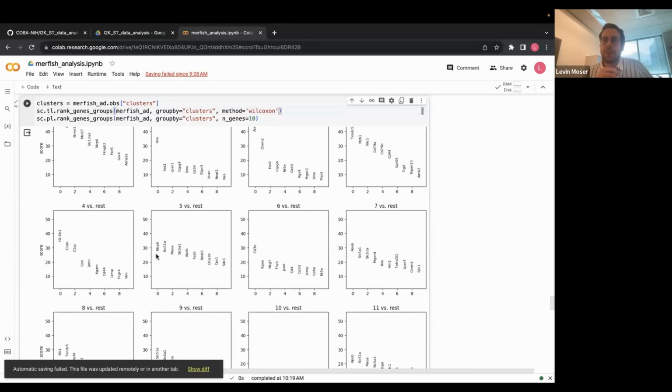I think this is really a great question because it gives you a hint, right? This notebook is nice and it's Python code, and you can visualize stuff. You can plot correlations and expressions, but at the end of the day, it's very important, like you just said, to try to make biological sense of these things, and it's not trivial to do that.